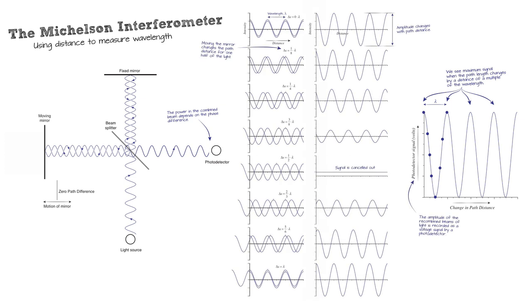So there's all the possible conditions, and I invite you to go through this and look at it in detail, model it. I did all of these calculations in a mathematical package. There's lots of ones available: Maple, Mathematica, MATLAB. There's even free ones such as Maxima, which you can download off the web. Runs on most systems, absolutely free, does the same thing. So if you can figure out how to do this with a math package, I have some notes on how to do it in Maple in the document that accompanies this lecture.